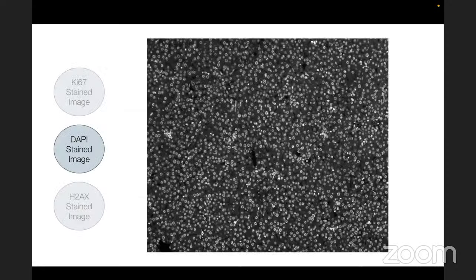All right, so the input for this plugin is a multi-image TIFF file. There are 3 different images included, and they're each stained with a different type of stain that will reveal different information about the tissue.